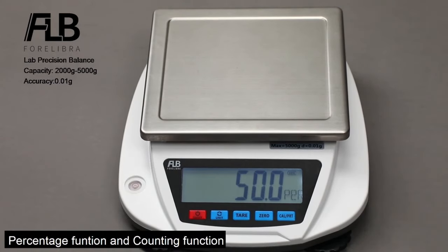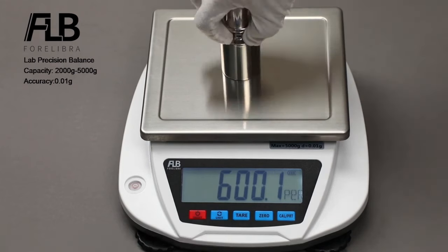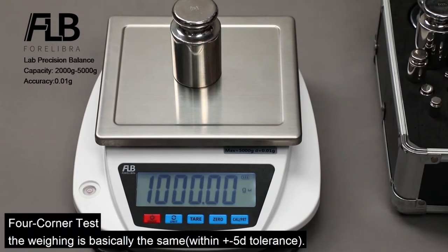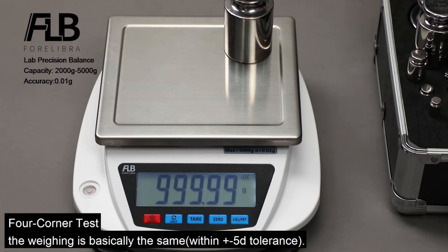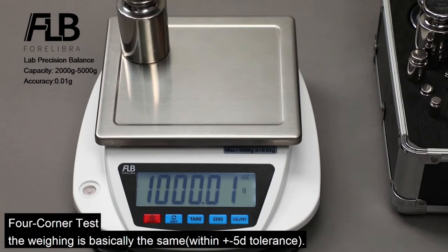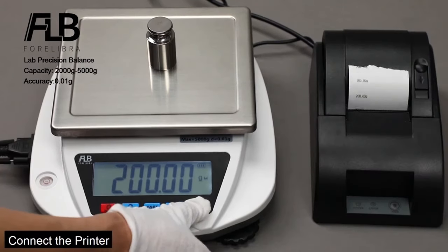It also serves as a scale for technological gadgets, ensuring accurate measurements for electronic components and devices. The FLB4 Libra Analytical Balance also functions as a kitchen scale, enhancing culinary experiences for both professional chefs and home cooks.